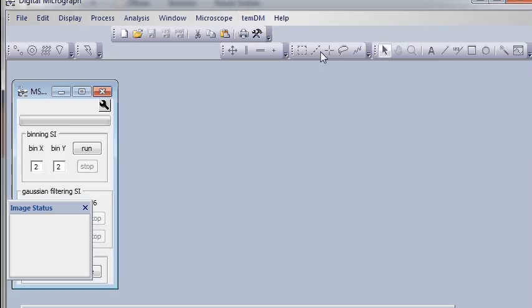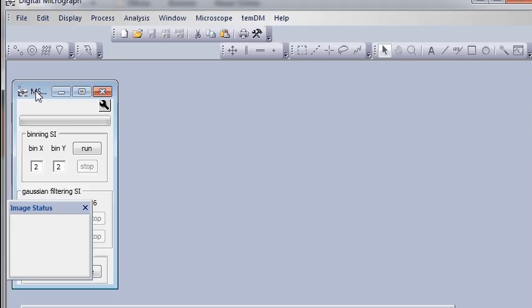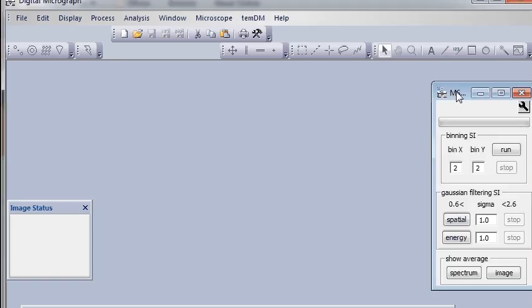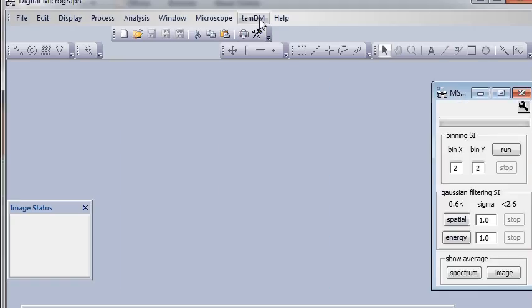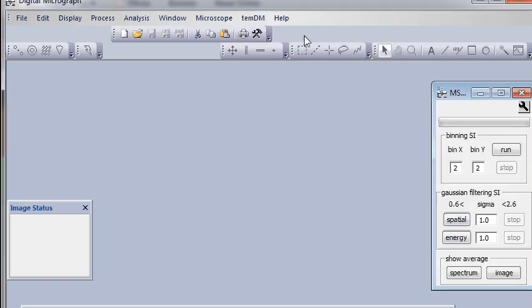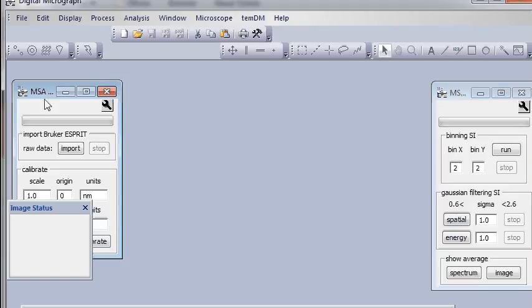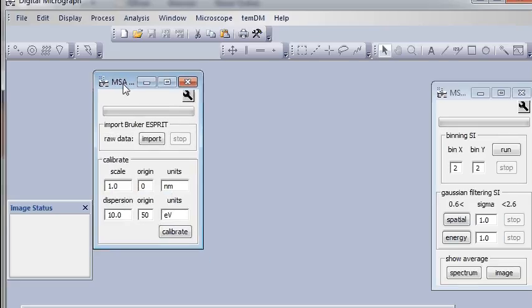For instance, filtering. Here we have filtering. Or for instance, import. Import is here. Okay. The plug-in is very user-friendly.